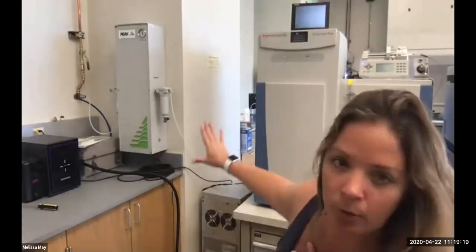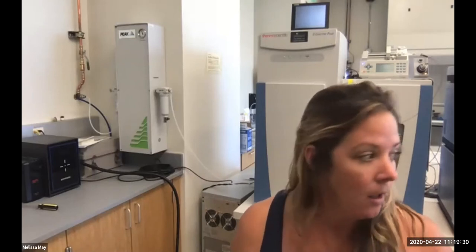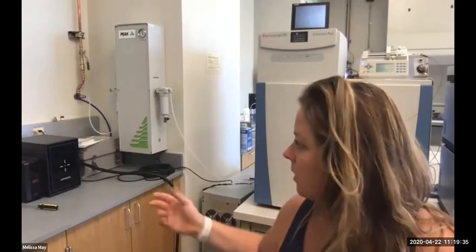So that's always something that you want to check and make sure that there's gas going to the instrument. If not, you're not going to be able to run it. And when they shut the house air off, you're going to have to put the instrument into its off state and then bake it out when it comes back on. And this has happened a couple of times.